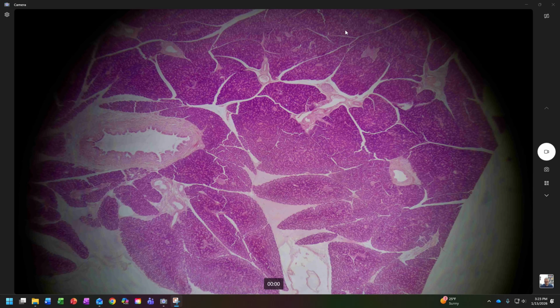vein or an artery. So that's why I'm thinking this is probably a duct. Plus it looks like we've got some, I don't know if that's significant smooth muscle. Arteries have smooth muscle in them as well, and veins do as well. It just doesn't look like a blood vessel because of that jaggedy inner surface. That just wouldn't work well with a blood vessel. So that's probably a duct. Again, I'm not concerned that we know that. That looks more like a blood vessel. If we get in there, we might see that it contains blood.